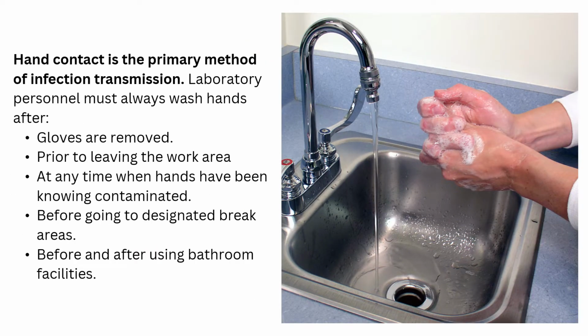We're very much informed that hand contact is a primary method of infection transmission. That is why laboratory personnel must always wash hands when gloves are removed prior to leaving the work area. Anytime you feel that your hands are contaminated, as much as possible, wash your hands every now and then. Also, wash before going to designated break areas or when you're going to eat your meals or snacks, and before and after using bathroom facilities.